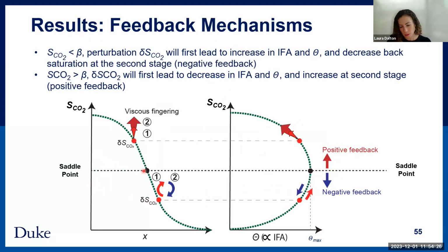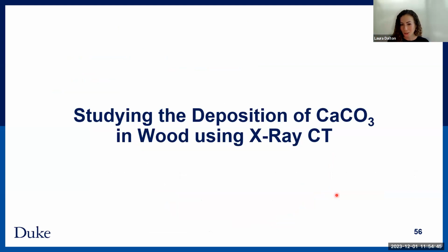And this is just showing some feedback mechanisms, based on where you're at with degree of saturation and what effect that will have on how stable the advancement of your carbonation front will be. But again, work in progress. Oh, and I'll just touch on this.